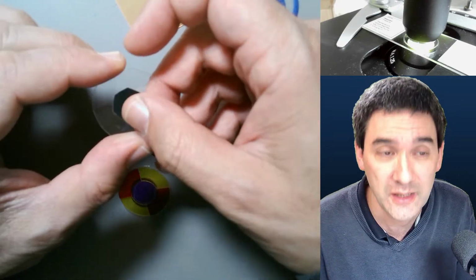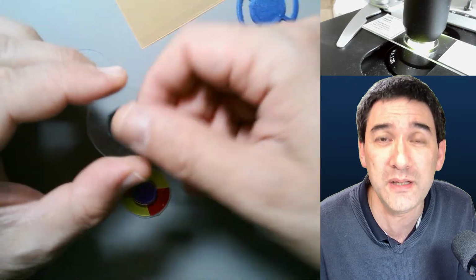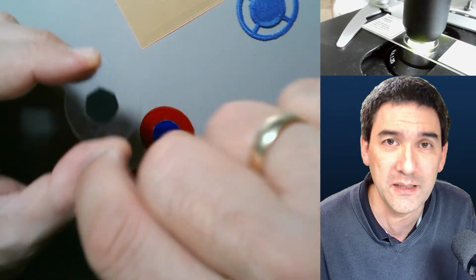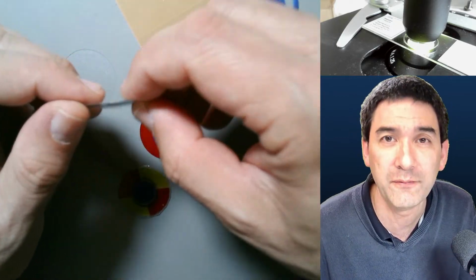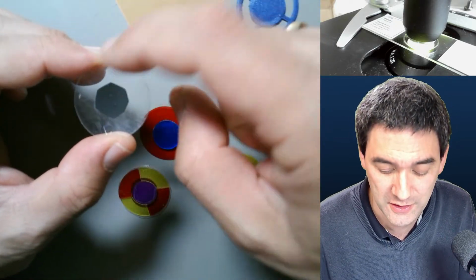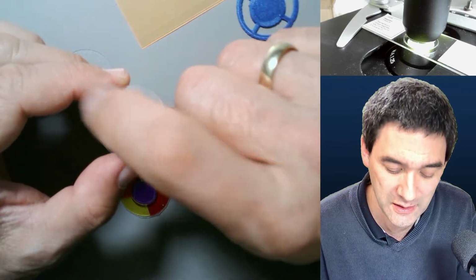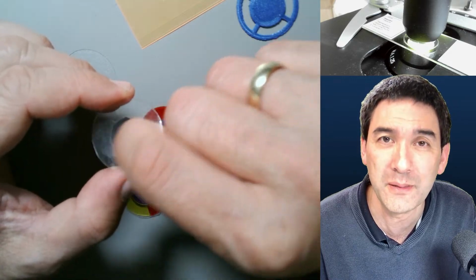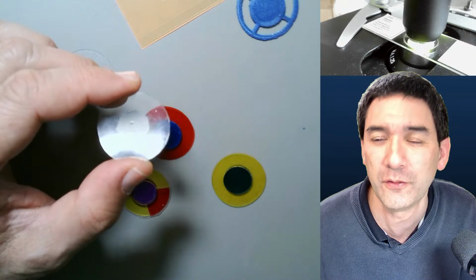And this can actually harm the halogen lamp because of overheating. If the filters become hot, that means the energy is absorbed, right? And you should not reflect it back into the lamp. I'm just saying, because I've actually done this in the past because I had problems blocking it out with my halogen lamp, and then I said, okay, maybe I'm just going to put some aluminum foil or some metal foil over here too, but this might cause overheating of the halogen lamp.